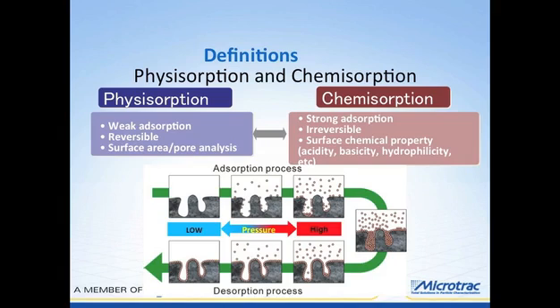But at this point, we can just reverse this process by reducing the pressure. So up until this point, we've done adsorption. Now we can go backwards and do the desorption measurement by reducing the pressure and the concentration of the gases, and we'll just follow the path back this way until we no longer have any molecules available for adsorption. Now, this is again a reversible process.